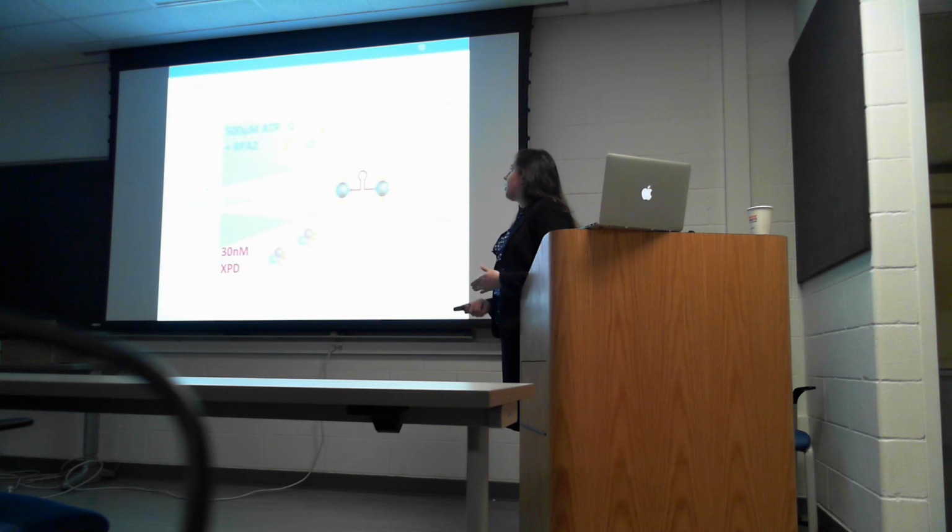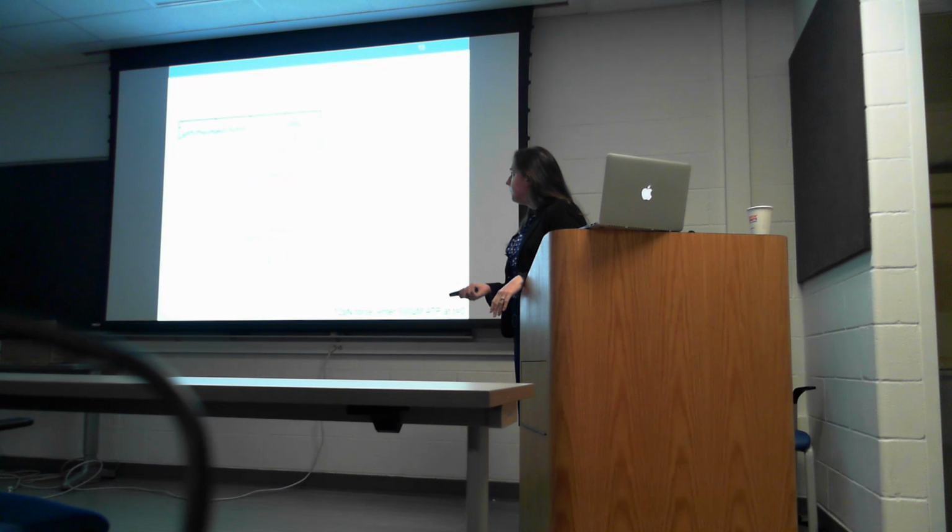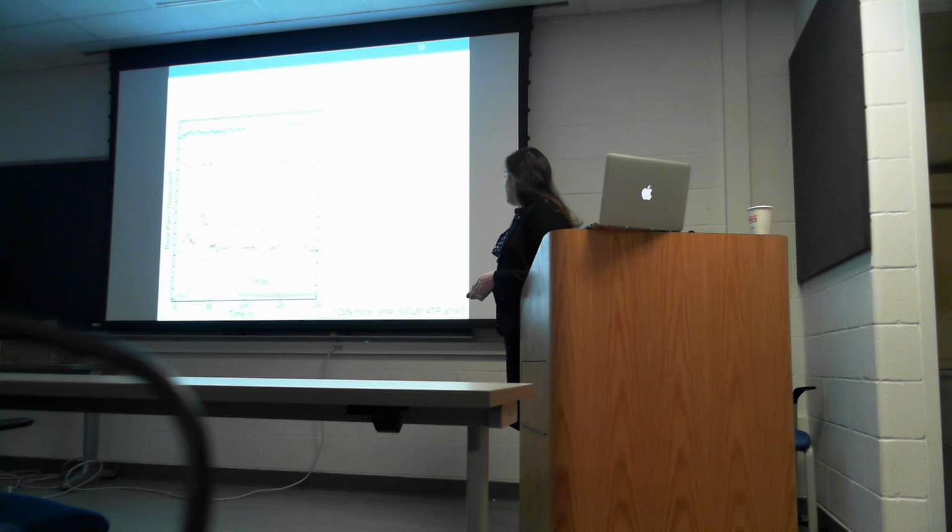So what happens in the presence of RPA2? To do these experiments, it's the same thing, but now I've mixed RPA2 into the ATP stream. So I incubate XPD, pick up a single XPD, and move into ATP plus RPA. Now as XPD unwinds, RPA2 is in solution to bind and interact as it will. In these experiments, I use RPA2 concentrations between 0 and 50 nanomolar, and always 12 piconewton force and always 500 micromolar ATP.